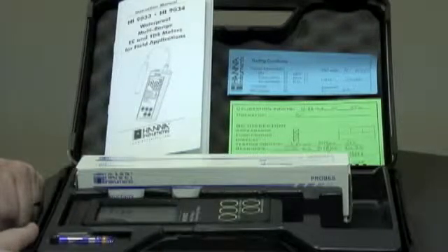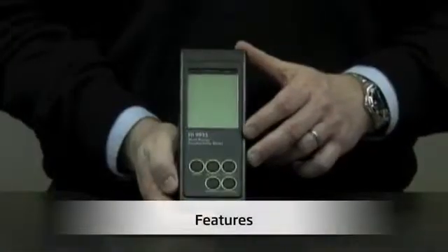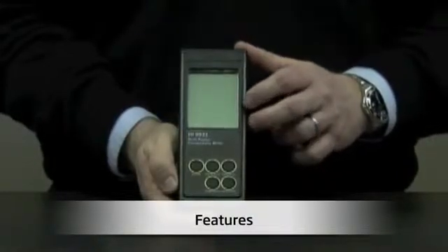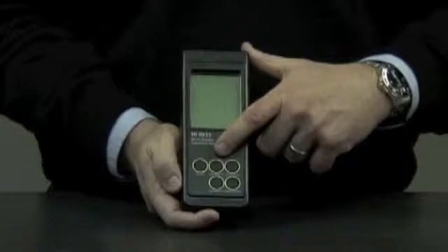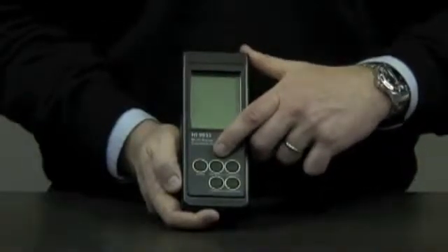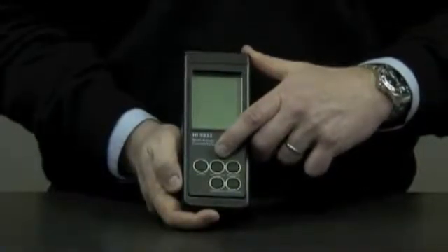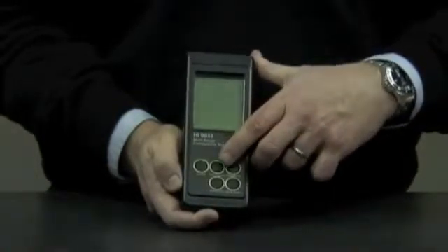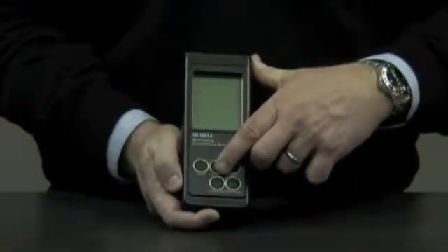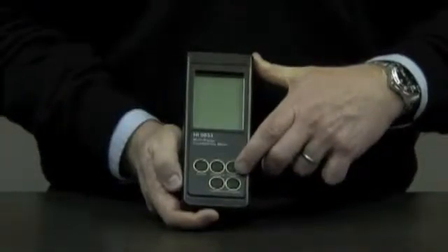Now I'd like to show you the features of the unit. We have a large LCD display, an on-off button, and four measuring range buttons: 0 to 199.9 microsiemens, 0 to 1,999 microsiemens, 0 to 19.99 millisiemens, and 0 to 199.9 millisiemens.